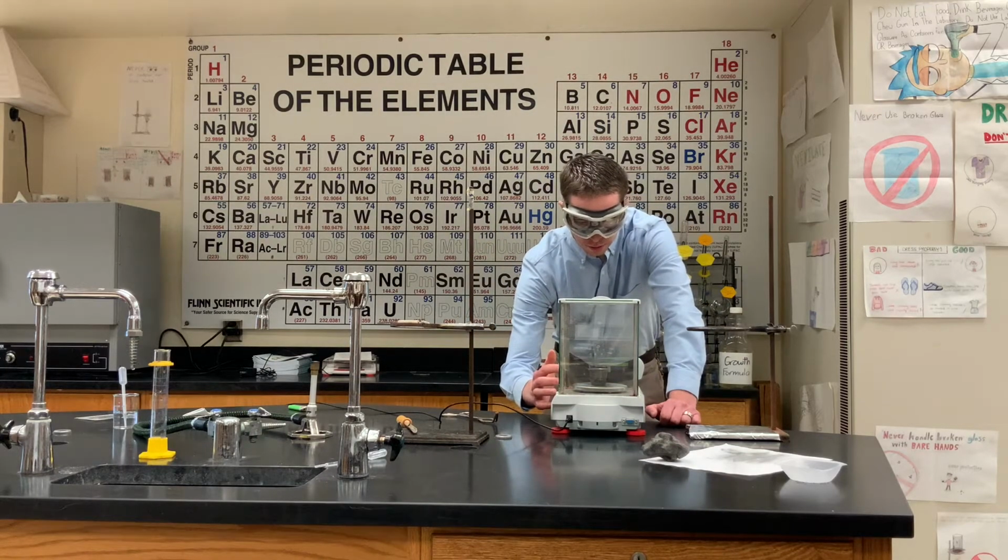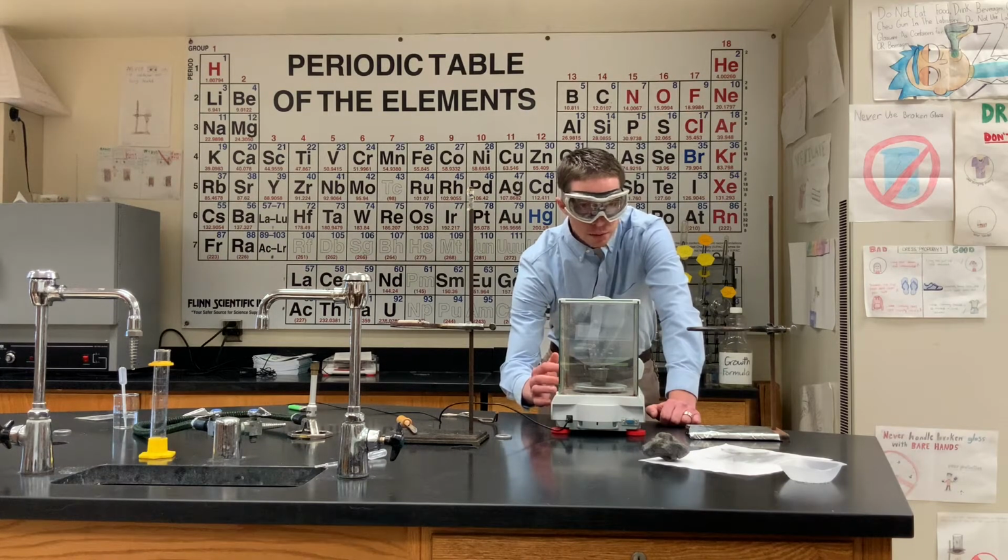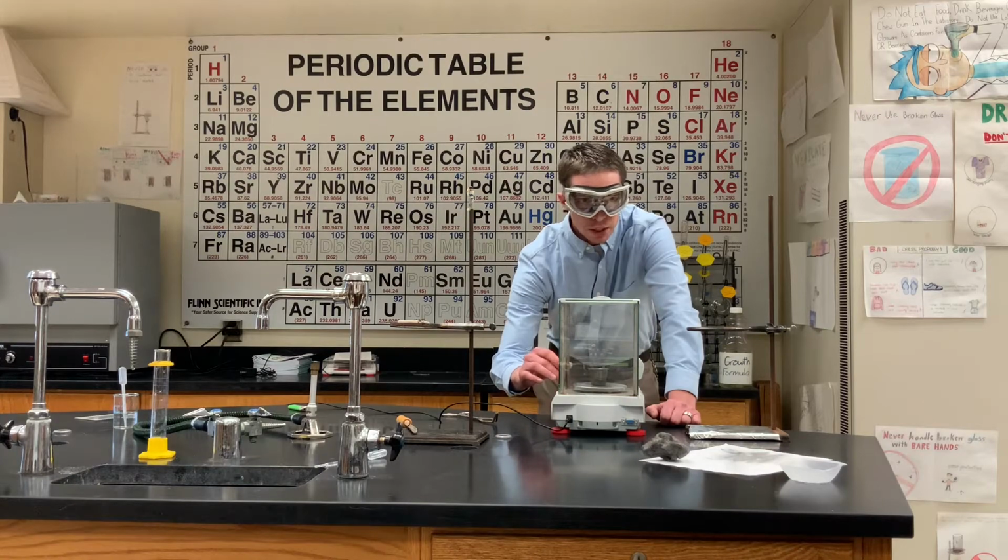The mass of the crucible lid is 27.508 grams.